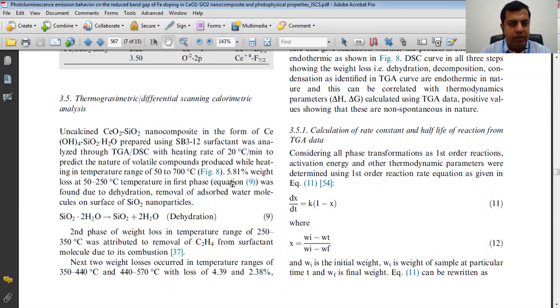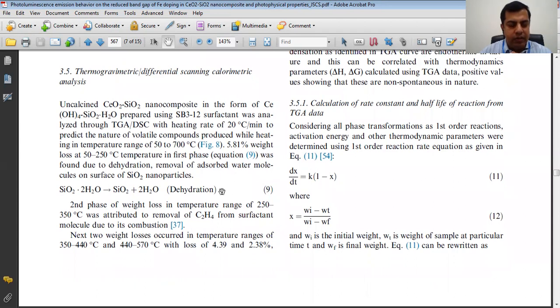If you want to calculate what type of molecules are releasing with a weight loss of 5.81%, this is the percent weight loss. You have to multiply by the total molecular weight. So if you multiply 5.81 multiplied by 621.7 and divided by 100, you will get the value around 36. 36 is the molecular weight of two water molecules because one molecule is 18.